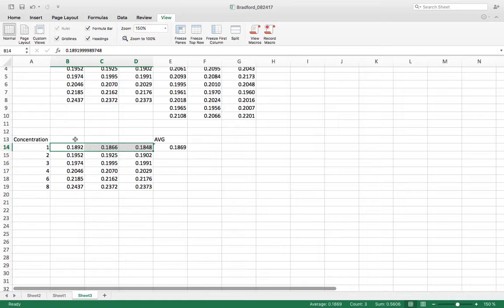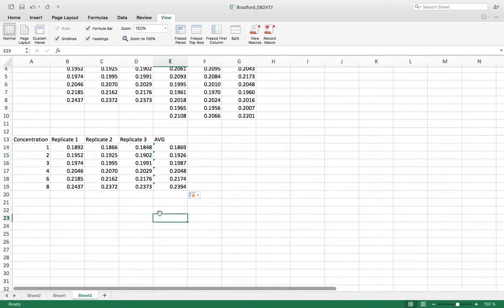See how it kind of goes around? But the average absorbance is what I'm going to use. So here I'm going to write replicate 1, and I think I can do replicate 2 and 3. These are all the same concentration, but the absorbance always changes for whatever reason, so it's good to have 3 in this case, and you can have a nice average. In your case in lab, you're getting an average of 2, so that'll be even easier. So using Excel, I can just pull this right down, and now I have averages all the way.